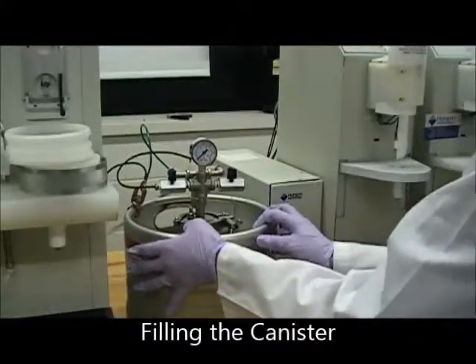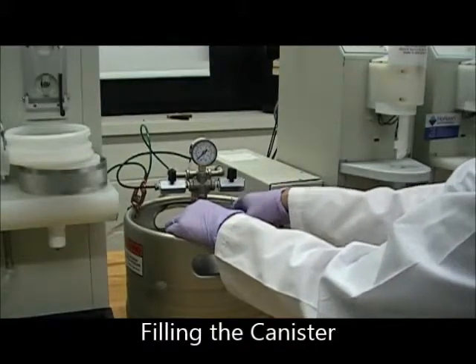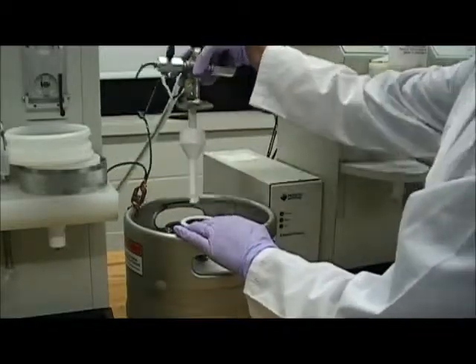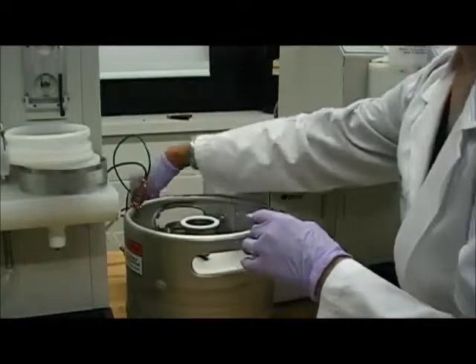Now that the connections are complete, we'll talk about how to take the cover off of the canister and fill the canister with solvent, either methanol or hexane. Loosen the clamp and remove the top of the canister, being careful not to contaminate the sip tube when you put it down.